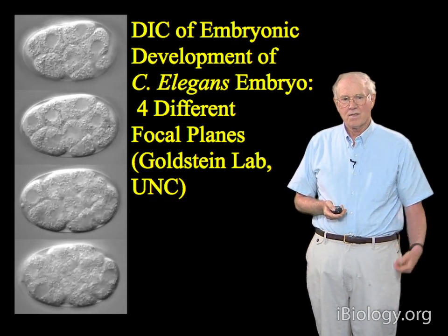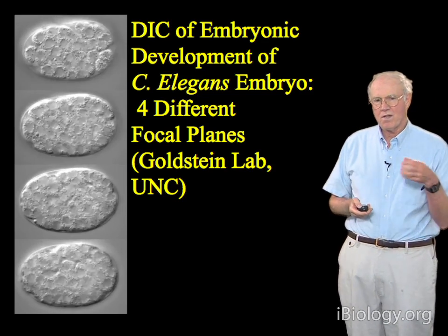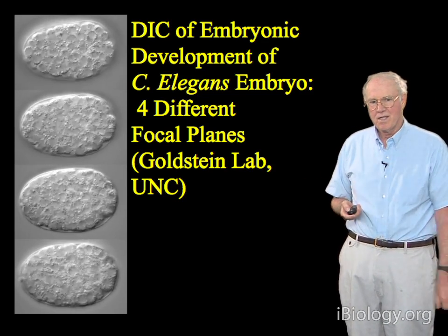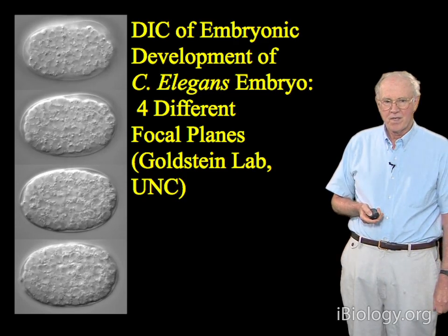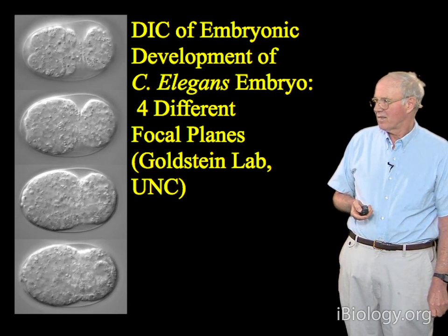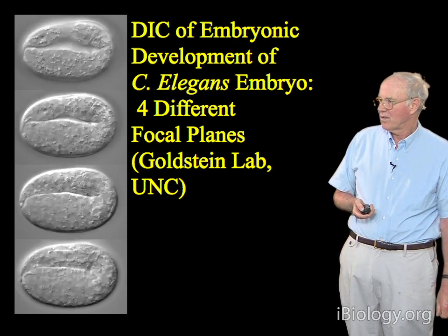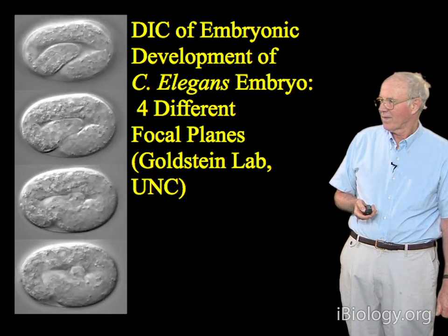Right? And so they use this information to build this developmental map of where all the cells are relative to each other in the developing organism throughout these many stages of development in making the final mature organism.